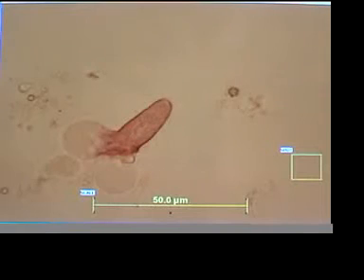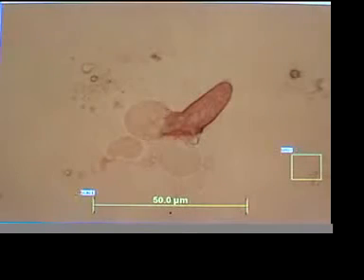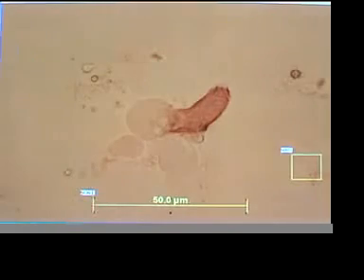I think I'm going to center him a little bit. Hang on. Okay, now he's more in the center of the slide. And then I can do this little effect, I'll cheat. Oh, the computer fell asleep. Okay, watch the top. Here we go. Big changes here.